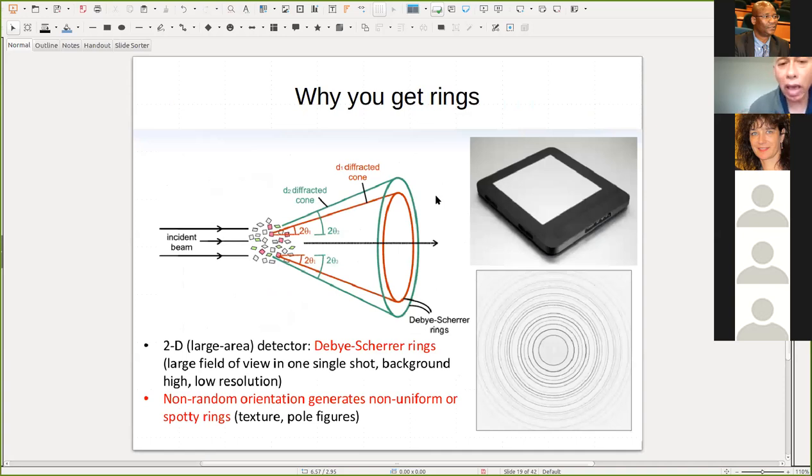Okay, so I showed you a powder diffraction pattern a minute ago, and I wanted to explain this a tiny bit more. On the right side, you've got an area detector. It's lying down, but it would record this image. Imagine you went out trying to find some mineral which you're hoping will make you rich. You grind it up and bring it to the synchrotron to figure out what structure it is. Because you grind it up, you have a whole bunch of little crystals in there, all pointing in random orientations. So you stick it in the beam, and if you ground it fine enough, you would see something like this: a whole bunch of rings, and each one is telling you about a particular d-spacing that's in the crystal.